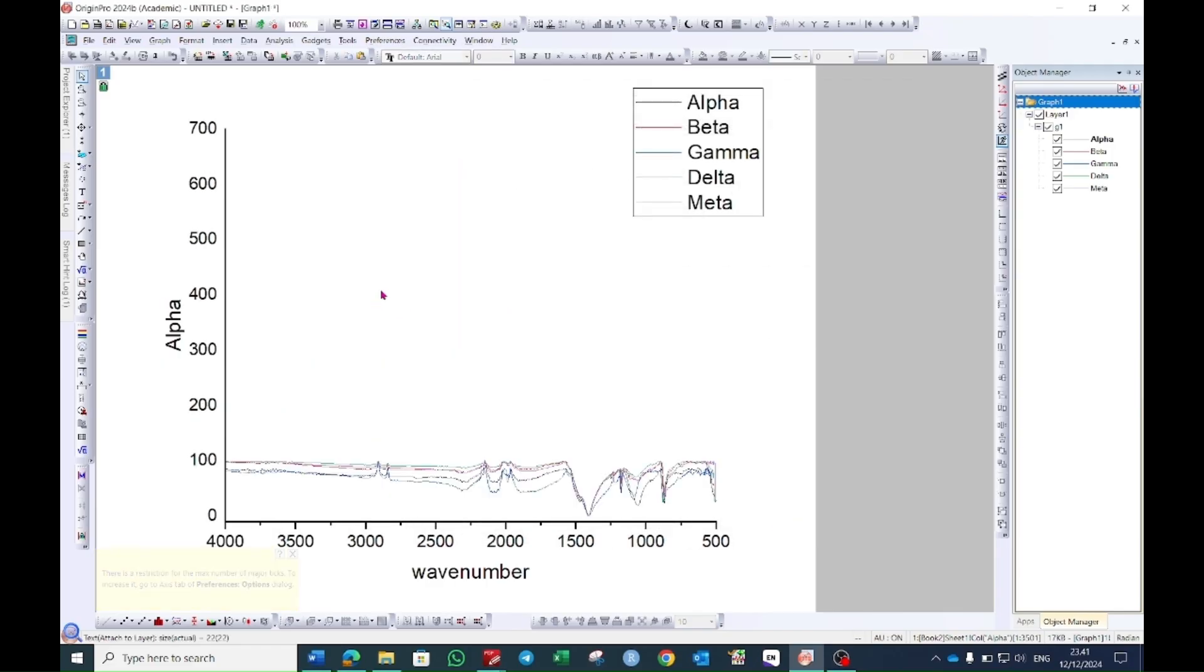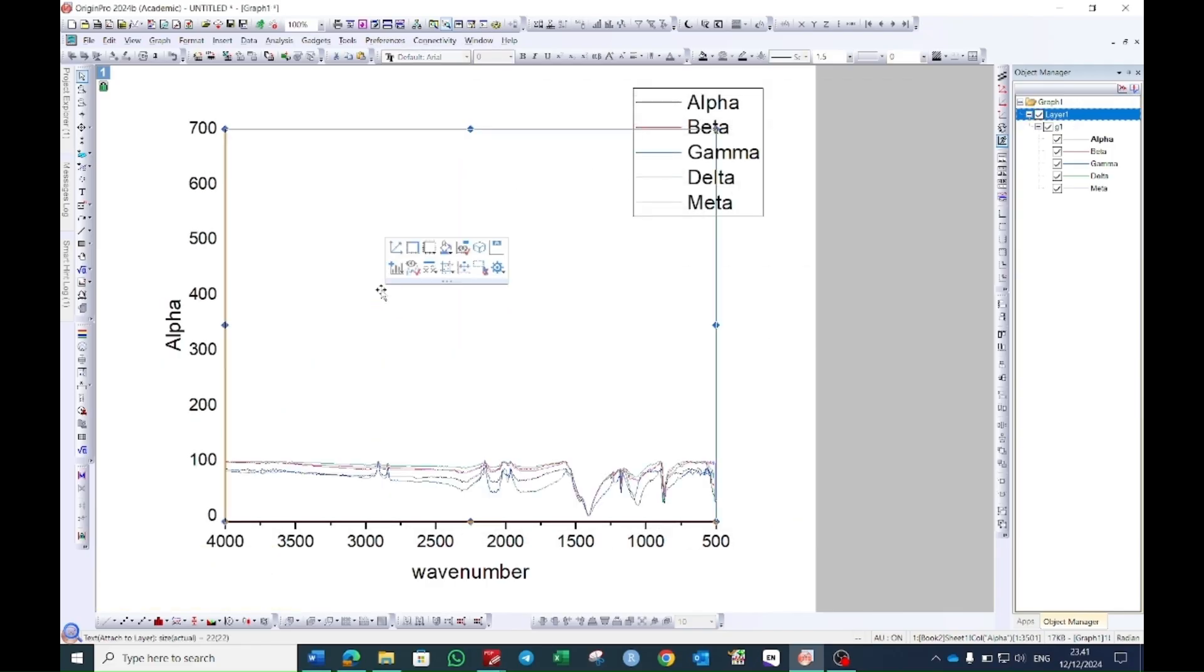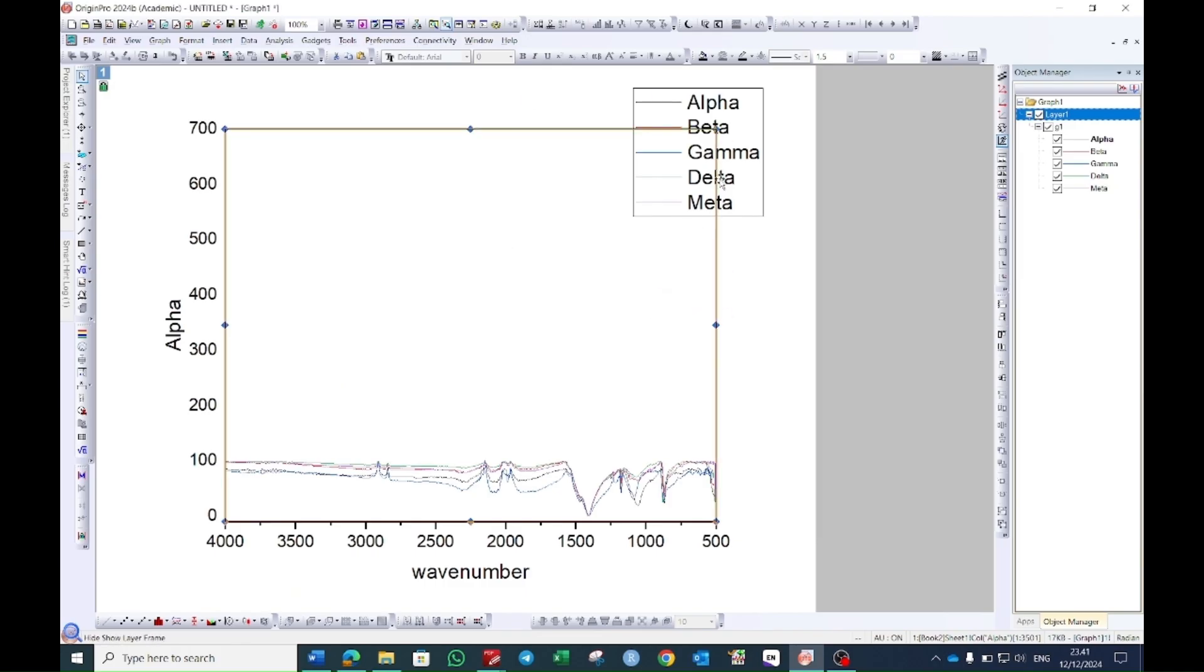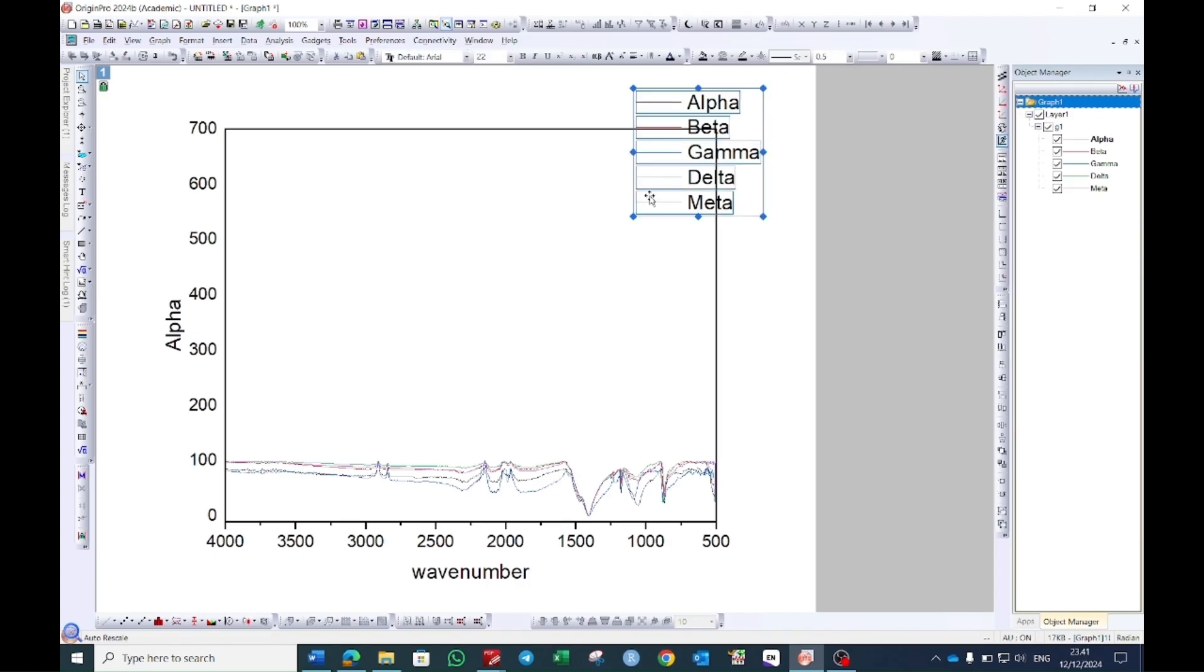Now just click on this graph. This window will pop up. You will see here it says layer frame. Select this one and in this way a box will be formed. Move this legend to the side and make it small.